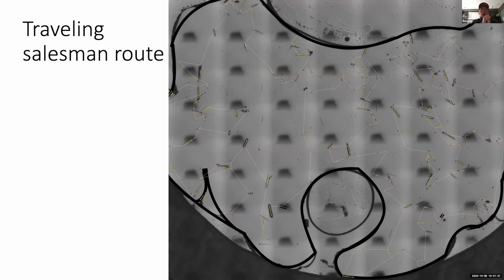Yeah. So far, we experimented with a few strategies that we are interested in. For example, this traveling salesman route, that would minimize the total travel, of course, to the interest of the time. That's our favorite strategy. But as I mentioned, prioritizing those crystals might be another one. We also experimented with that one. The paired light and dark strategy is potentially another strategy that may have a point.